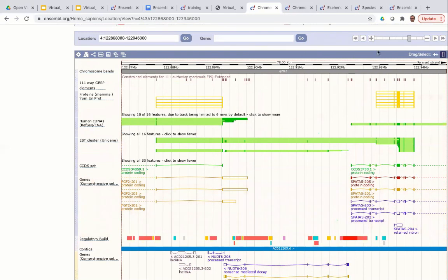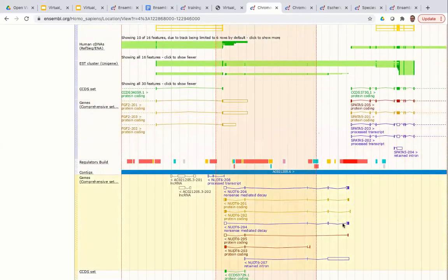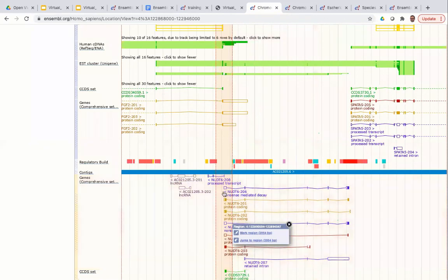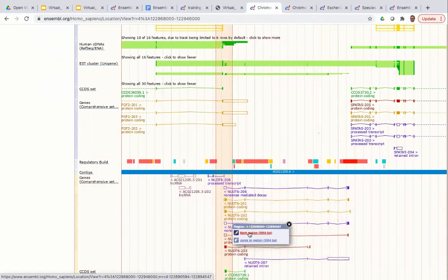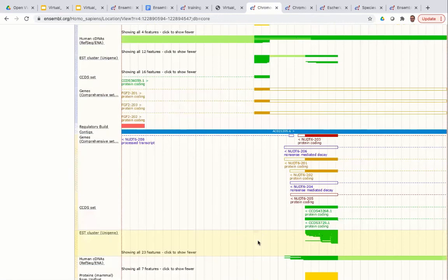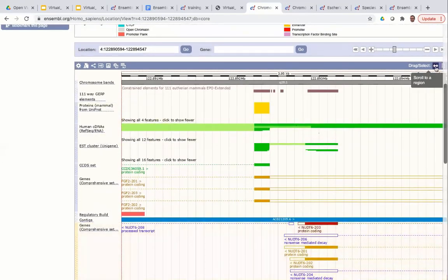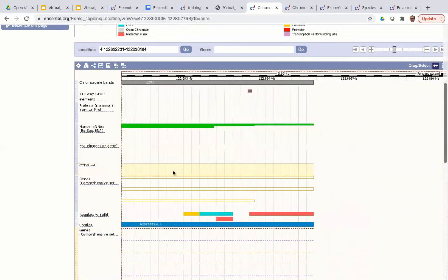You can also use the options in the blue bar at the top to manipulate the view. On the right-hand side is a dotted box and double-headed arrow. Selecting the dotted box means that when you click and drag within the window you draw a selection box — for example around a specific exon of NUDT6. You then get a pop-up with options to mark (highlight) the region or jump to it. Clicking 'jump' reloads the page focused on your new region, effectively zooming in. Selecting the double-headed arrow instead lets you click and drag to pan up and down the genome.